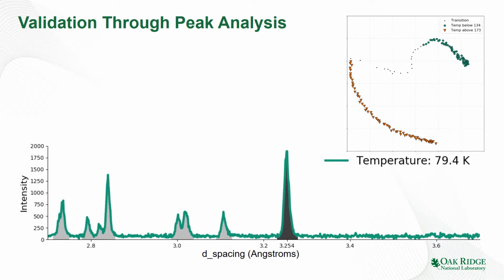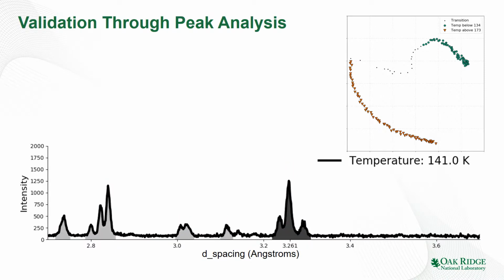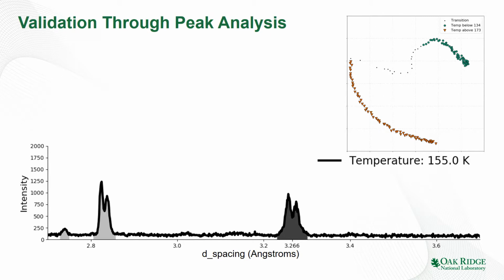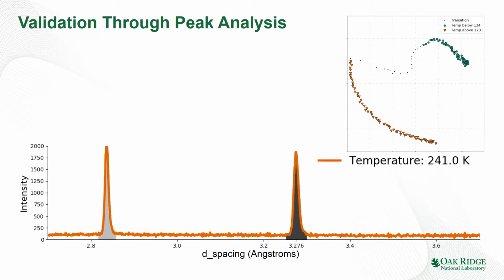As we start to get closer to that 134, you'll notice the smaller peaks in the middle start to shrink. That'll start happening here. As those peaks shrink, we broadened out, we became a triple peak, and now it's recombining. It's a split peak and then back to a single peak. And as we watch, we can see the center of that is drifting to the right. You can see it slowly ticking up there as we move on. And this continues all the way out to about 300 degrees where the temperature stops.